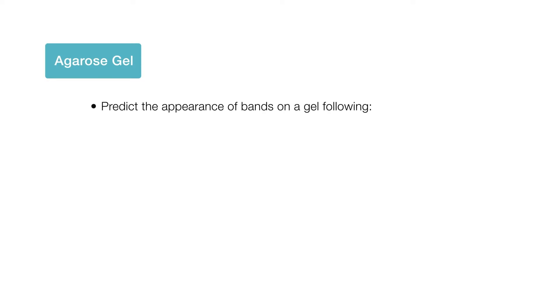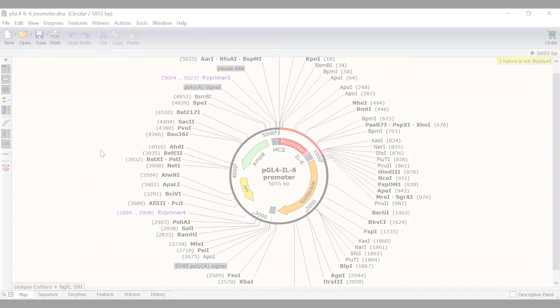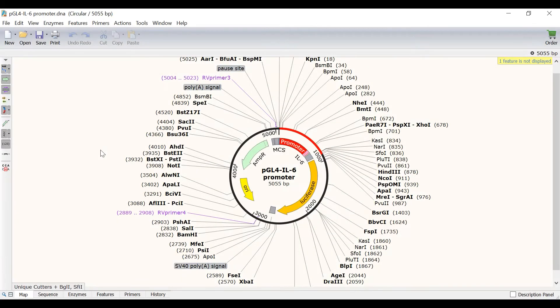In this tutorial, I will show you how to simulate agarose gel electrophoresis in SnapGene. Simulating agarose gels is a useful tool to predict the appearance of bands on a gel following restriction digests or PCR amplification. Within SnapGene, I have a file containing a pGL4 plasmid that includes the interleukin-6 gene promoter.